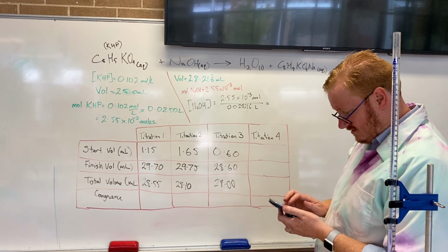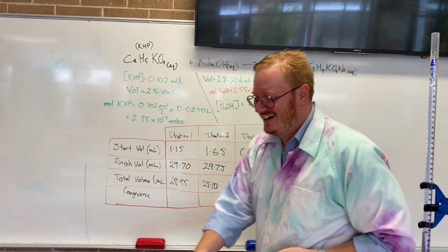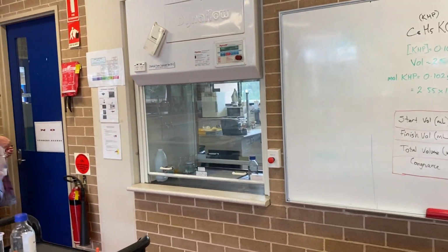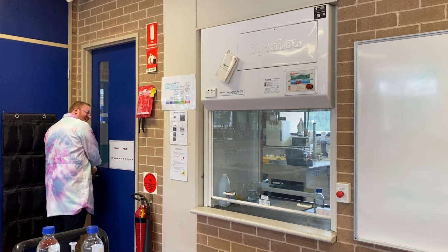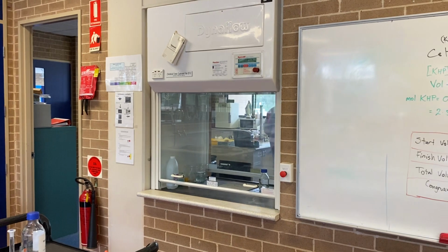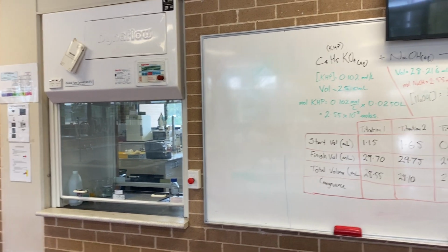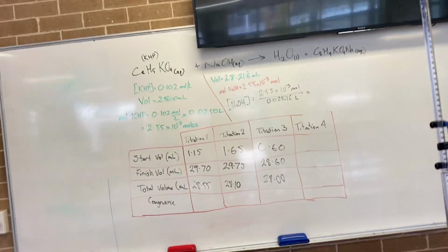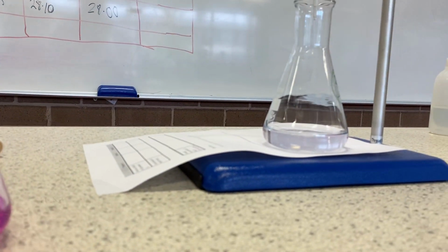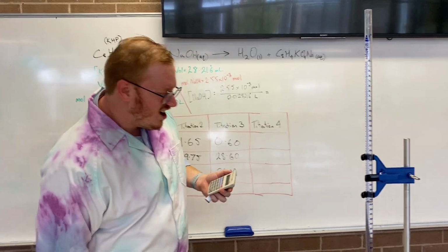Oh, I didn't like that. The calculator just went dead. I'll just grab a calculator. Oh, the door's locked. What a time for a calculator to go dead, hey? Oh, you got one on the phone. Calculator just went dead in the middle of the video. Yeah. Alright, got the Crayola calculator. A nice little simple kiddies one. It'll do.